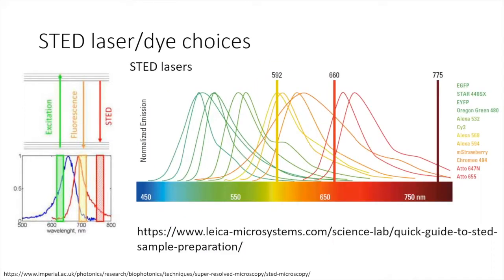In this case, this website is very useful if you're interested. They list multiple chromophores with different STED beams. So based on their information, you can choose which chromophore you want to use and which STED beam you want to use for your STED imaging.